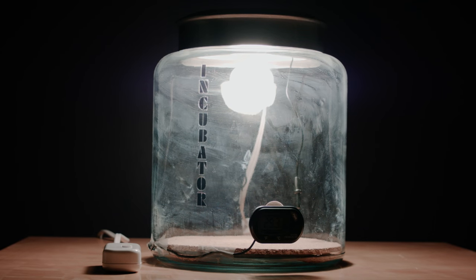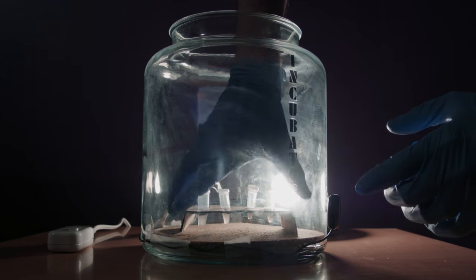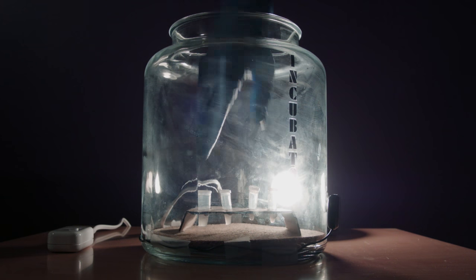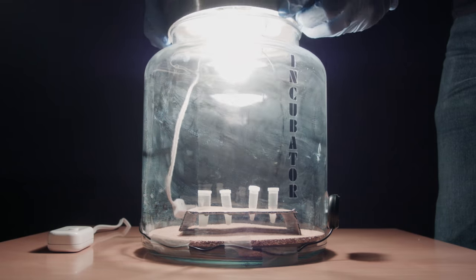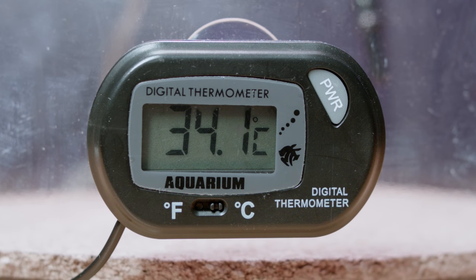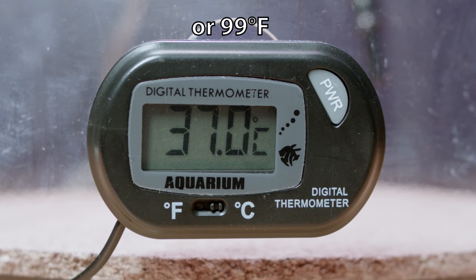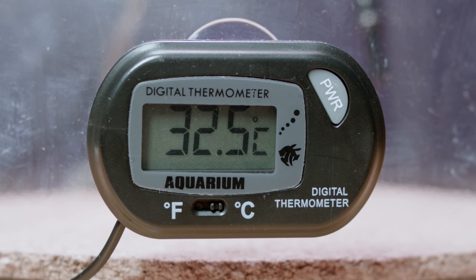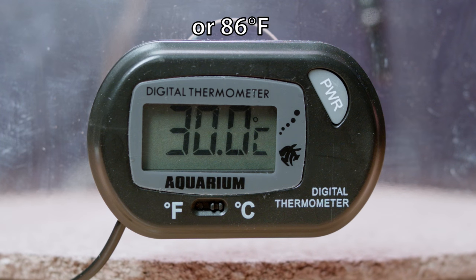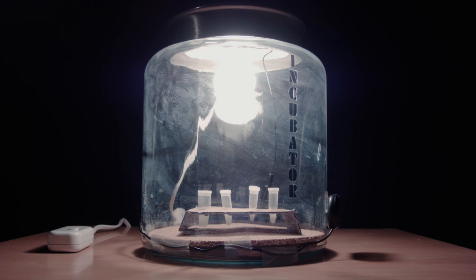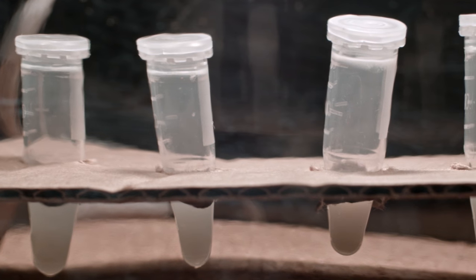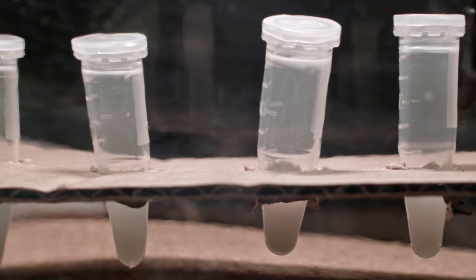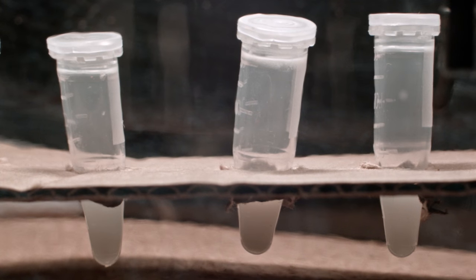Lacking a proper incubator, I made my own. I suppose I could have used this for the heat shock, but the instructions said to use water and making stuff is fun. Incubate the E. coli mix for 2 hours at 37 degrees Celsius, or 4 at room temperature if you don't have an incubator, and 30 degrees for the yeast mix for 4 to 6 hours or overnight at room temperature. I made multiple competent cell mixtures for each in case of failure. This allows the cells to recover from the transformation process and let the engineering process do its thing.